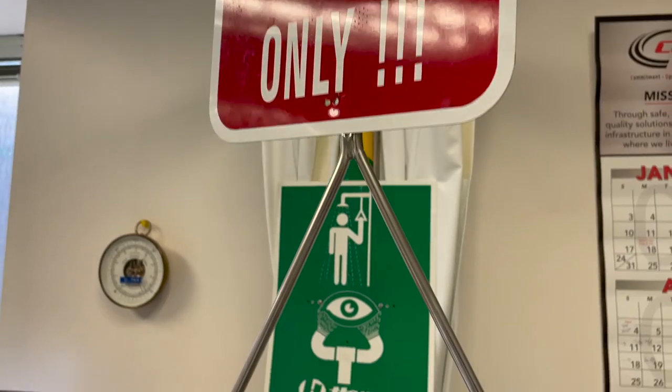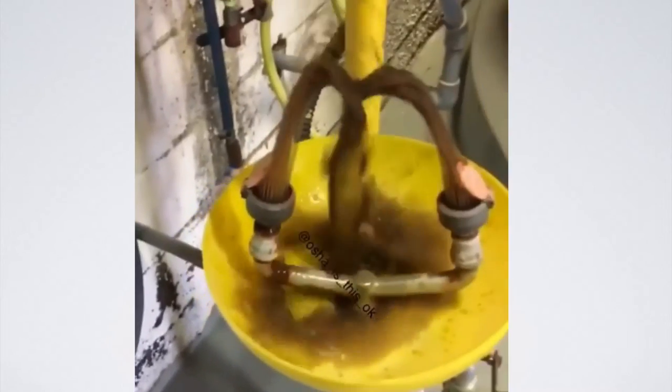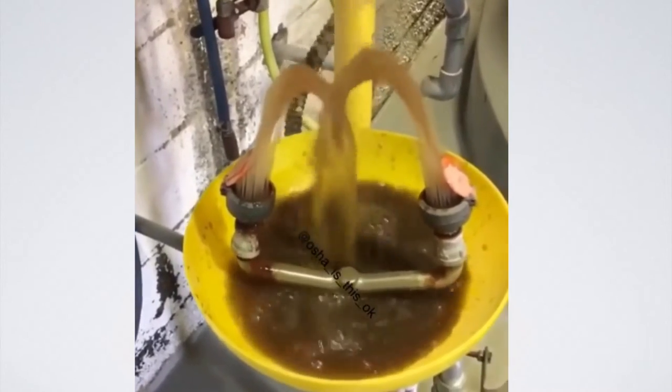Test those plumbed stations to ensure water will flow and that the water is clear. Water in stations that are not flowed regularly can become rusty.